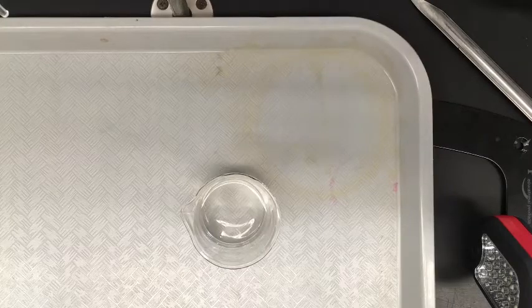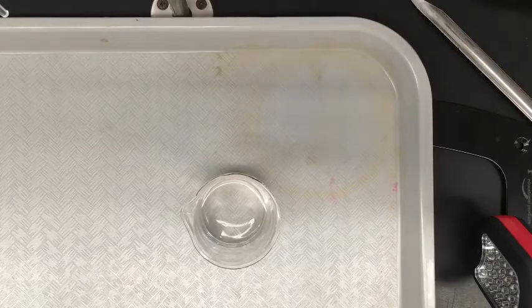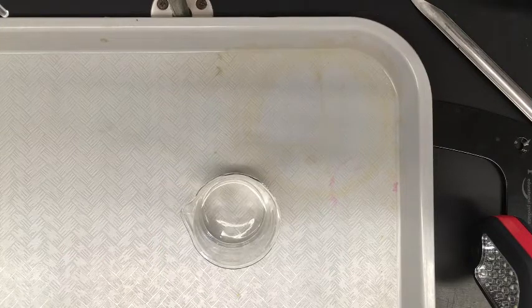So I've prepared my 40 milliliter solution of the diluted acetic acid. So now we have 40 milliliters of 0.1 moles per liter acetic acid. And I've recorded down that I am using 0.1 mole per liter sodium hydroxide. I am reading my initial reading on my burette to be 8.0 milliliters. And now we will do our titration using the pH meter.